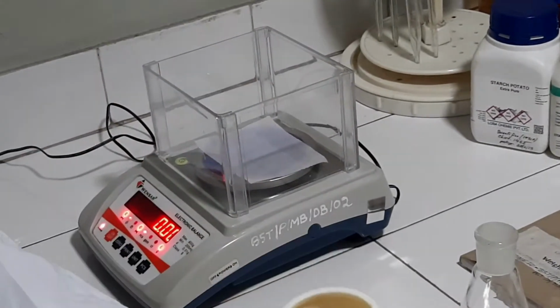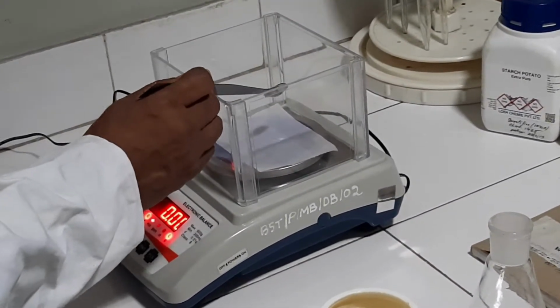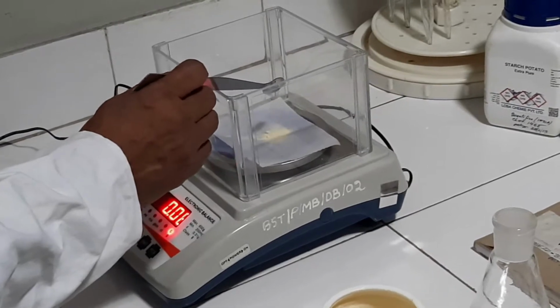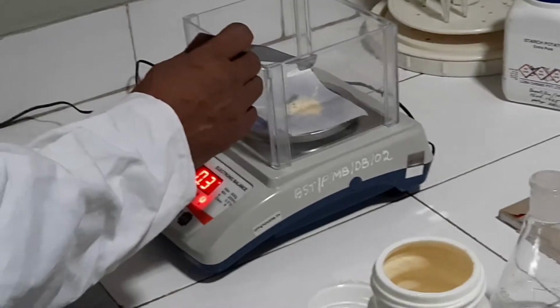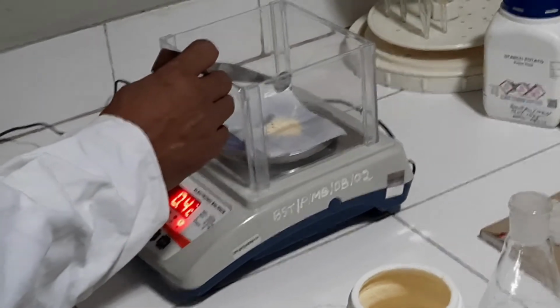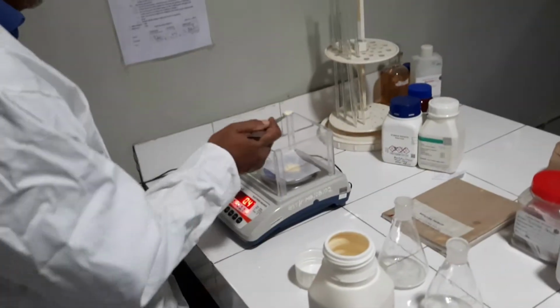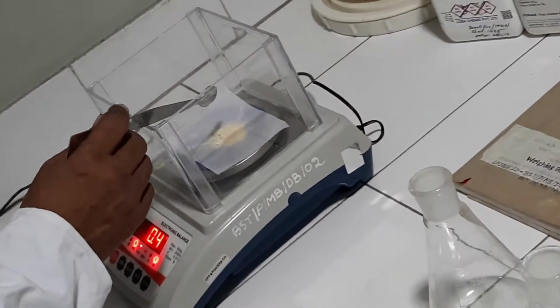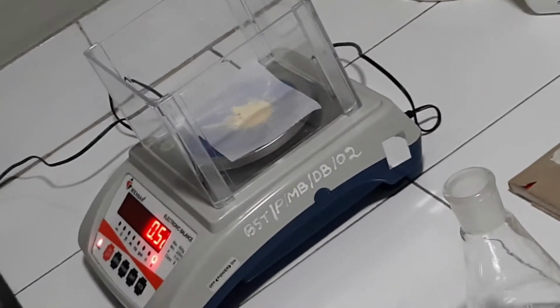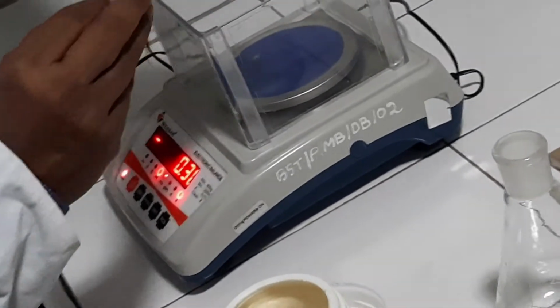For beef extract you will have to do the weighing very fast because it is hygroscopic and it will stick to where it is kept. So this is 500 milligram for solid media.